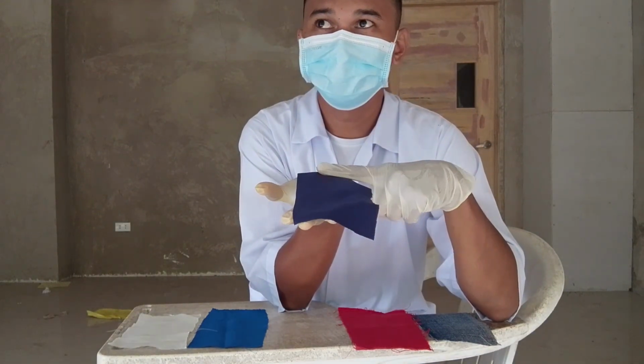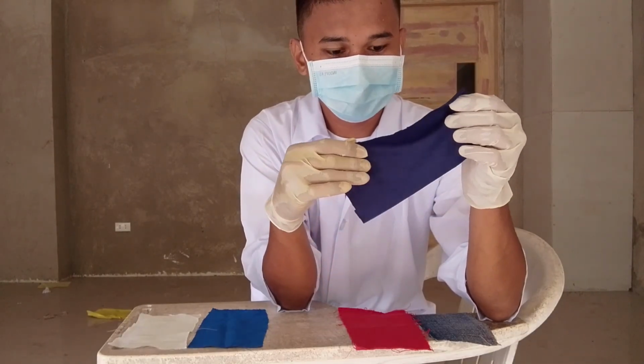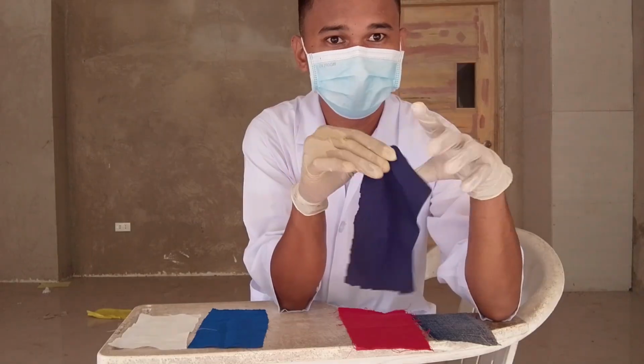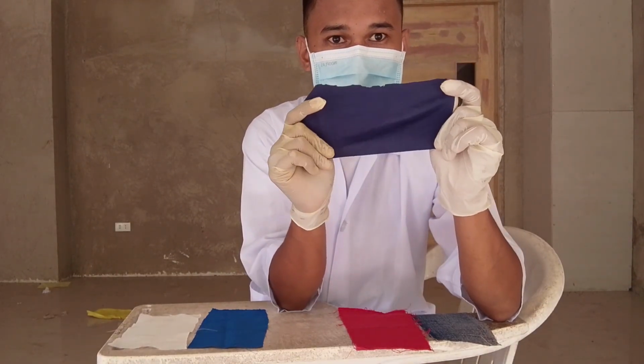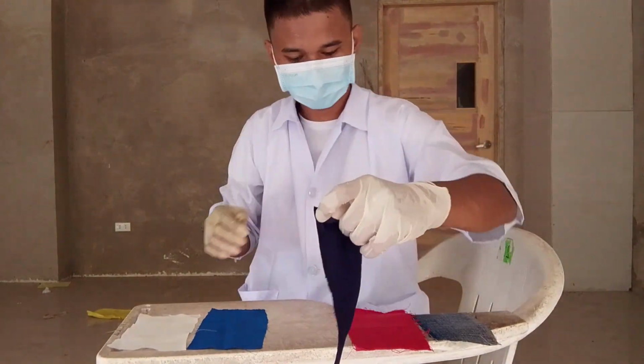Texture. So the texture of this jersey fiber is soft and stretchy. As you can see, it is stretchable. And the shape of this is rectangle, and the size is 3 by 10 inches.